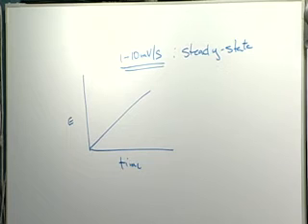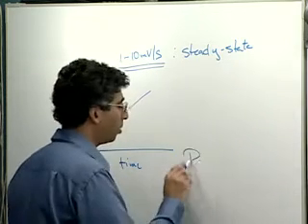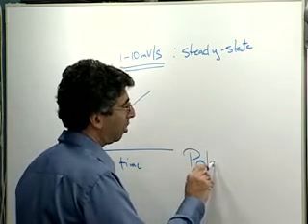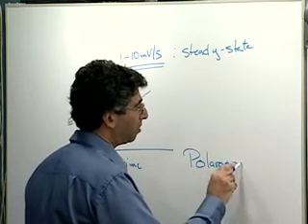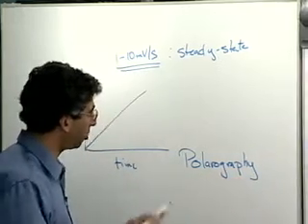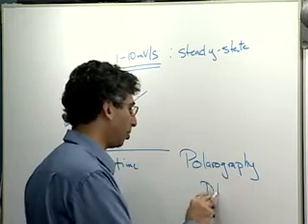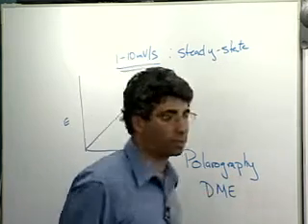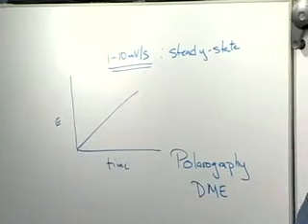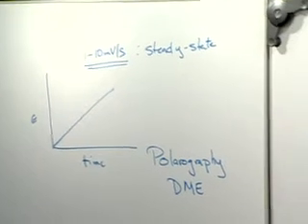So this idea of polarography and the dropping mercury electrode that goes with that as a start comes out of the Czech Republic, or Czechoslovakia at that time, by a gentleman by the name of Heyrovsky, who received the Nobel Prize for his work in the late 50s.